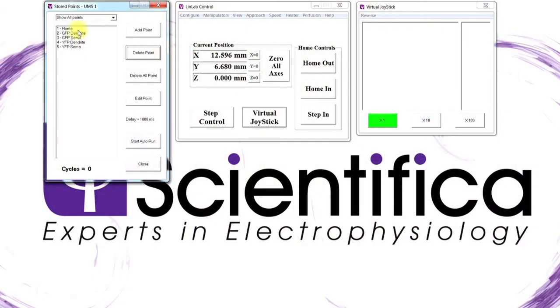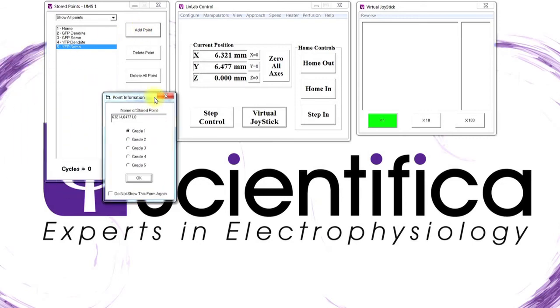As with all our motorized products, the Linlab software can be used to store an unlimited amount of locations, allowing you to easily navigate to previously patched cells or areas of interest. It's also possible to integrate the motorized systems into other software.